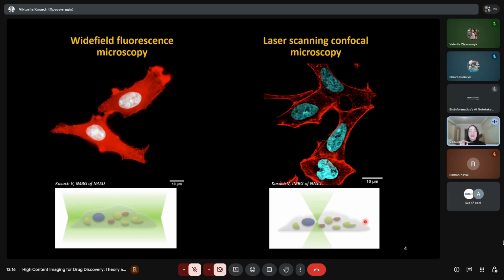However, engineers went even further, and on the market there are actually spinning disk automated microscopes with two spinning disks that are working simultaneously, enhancing the light that they could collect and even faster than the other ones.